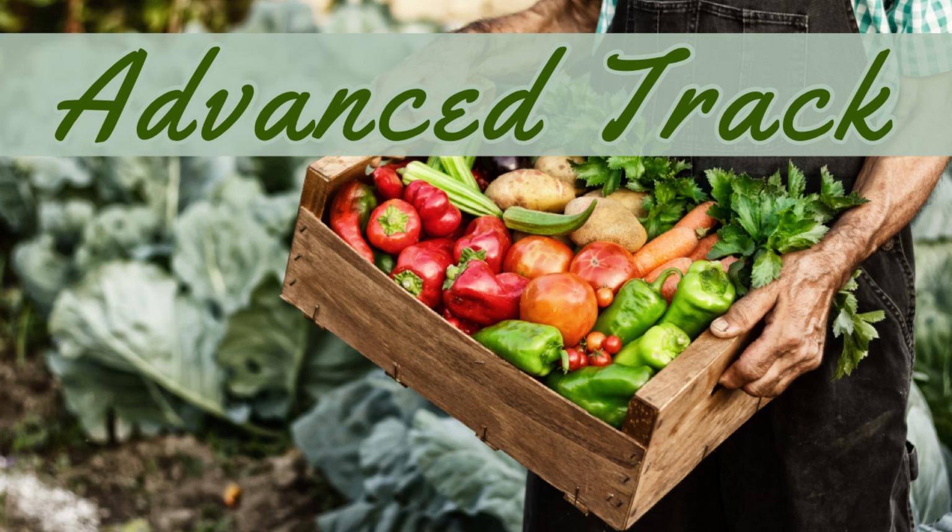The other aspect of consistency, how deep do I go? I don't care. Just do it the same. So I hold it, I put it in, I blow out a bubble, bloop. I take in a drop. Guess what happens at that point? I literally just put it on a piece of glass, put another piece of glass over the top of it, and then I take a look.